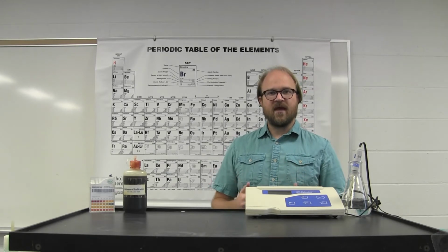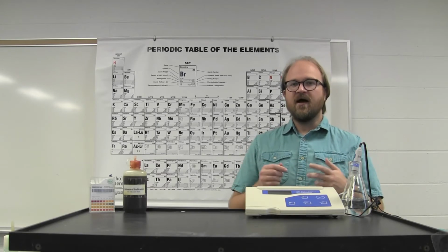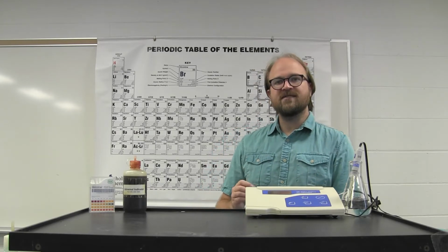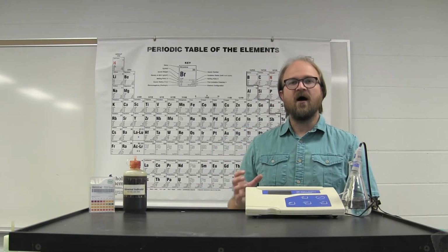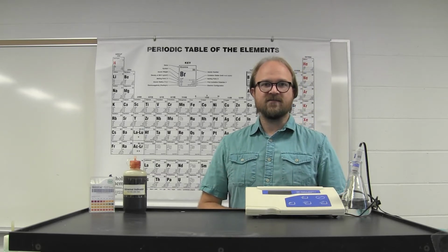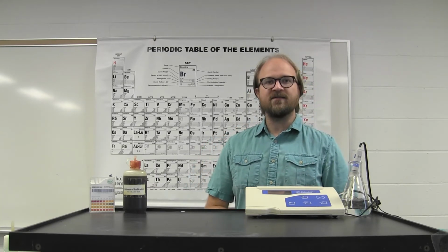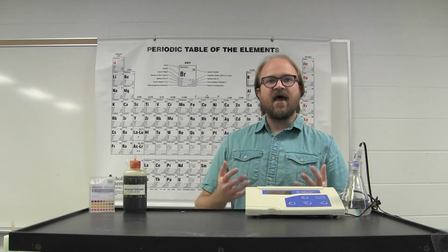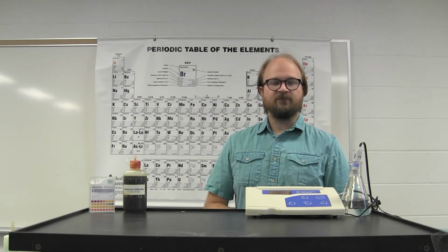This experiment looks at measuring the pH and converting that into a concentration of H+ and a concentration of base for varying solutions. It also looks at the equilibrium reaction of these acid-base reactions. You've already looked at equilibrium reactions in other types of chemistry, and this focuses on the equilibrium between those acid and base ions as they react with each other.